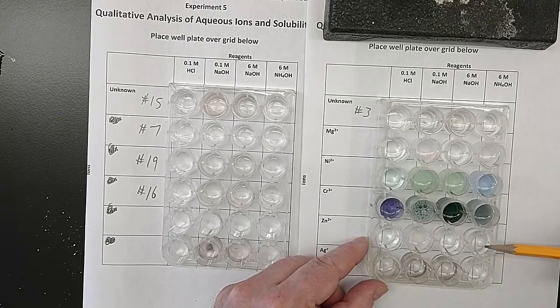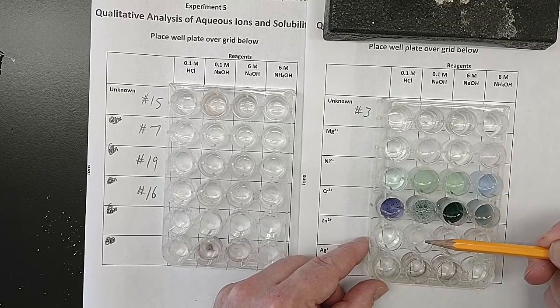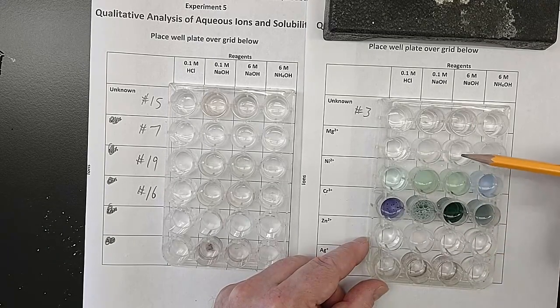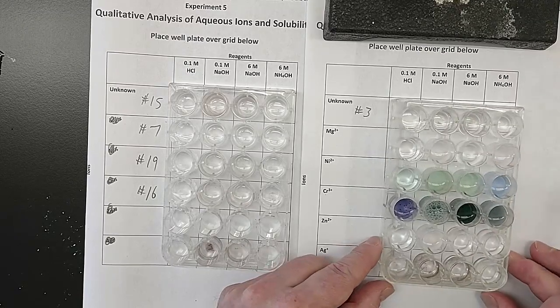They look pretty similar, but there's a definite difference. These were all cloudy and white for the magnesium. This one was cloudy and white for the zinc, but the other two went back to clear and colorless, demonstrating the interesting behavior that's different between a main group element, magnesium, and the transition element, zinc.